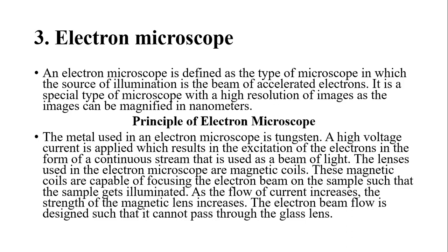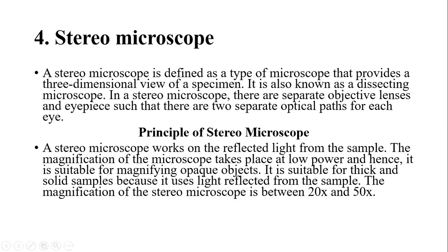Yes, that is all about an electron microscope, and as we can see, it uses electrons and a beam of light to illuminate the image. Let's go to the next type of microscope. We have a stereo microscope. Vivian, please take us through.